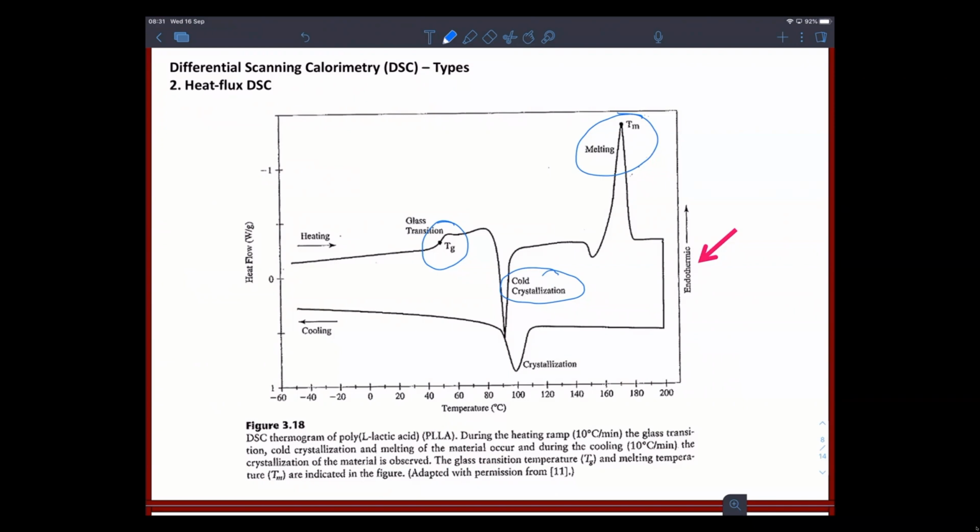at the same point. And then when we go through the cooling cycle, so we've reached about 190 or just over 190 degrees C. As we start to cool things down, we can go through another crystallization step, which is called melt crystallization. Till we eventually cool our polymer right down. Now these two, the TG and the cold crystallization, are related, so I'll come back to that a little bit later on.